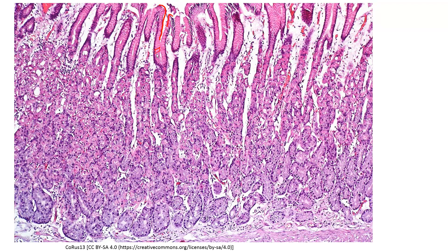The surface epithelial cells are essentially goblet cells — columnar mucus-secreting cells that will be making the mucus layer to protect everything up here at the surface. As we move downward into the gastric glands, we see mucus neck cells: small, very dark-staining, very basophilic cells. These will be producing more mucus and protecting the more delicate tissues further down in the gastric glands.